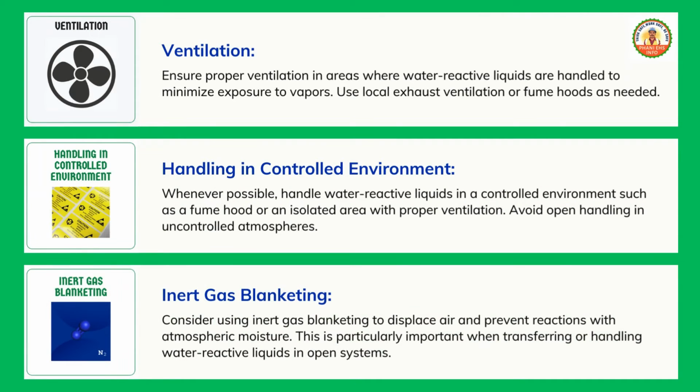Inert gas blanketing. Consider using inert gas blanketing to displace air and prevent reactions with atmospheric moisture. This is particularly important when transferring or handling water-reactive liquids in open systems.